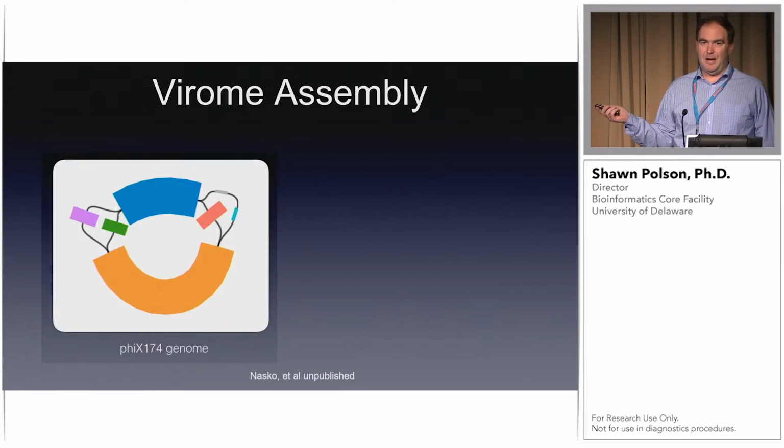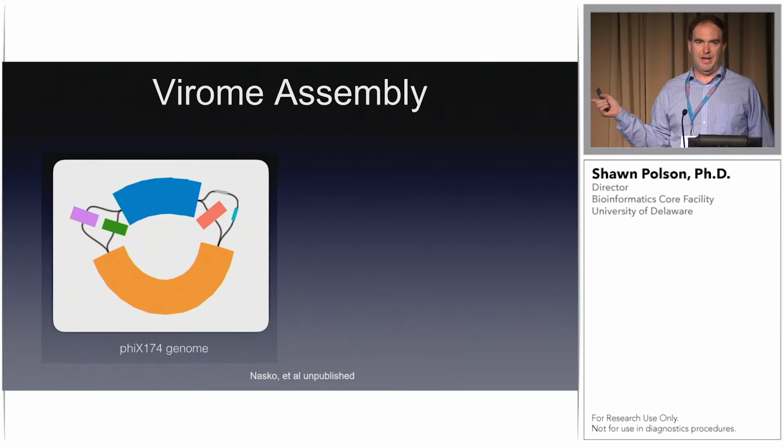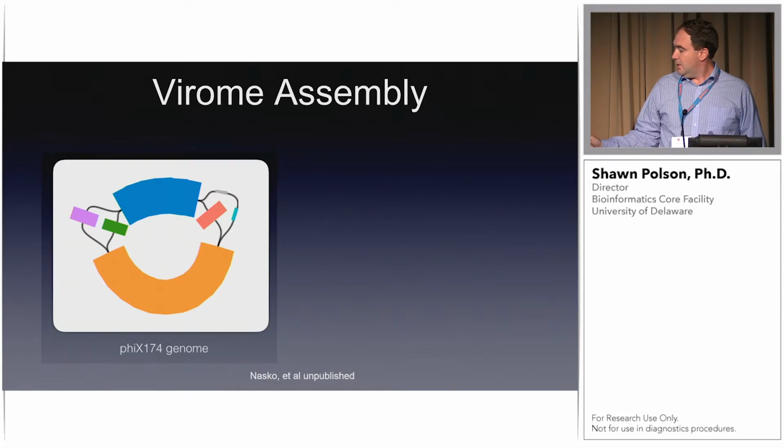So just to illustrate how we can see this, just imagine this as a graph showing how the assembly for a very short genome went together. It's PhiX174, and there's two different variants in this population. So you can see this is kind of the circle of the genome, and at these points, we've got a few branches where there happen to be a few genetic variants. That's how you would expect one of these to look.